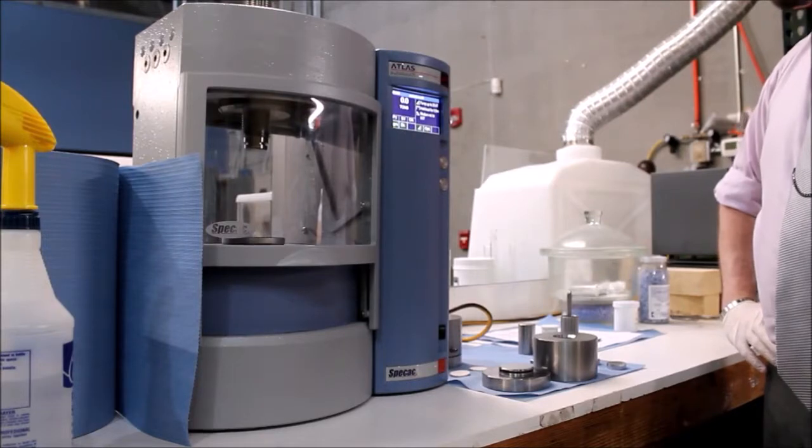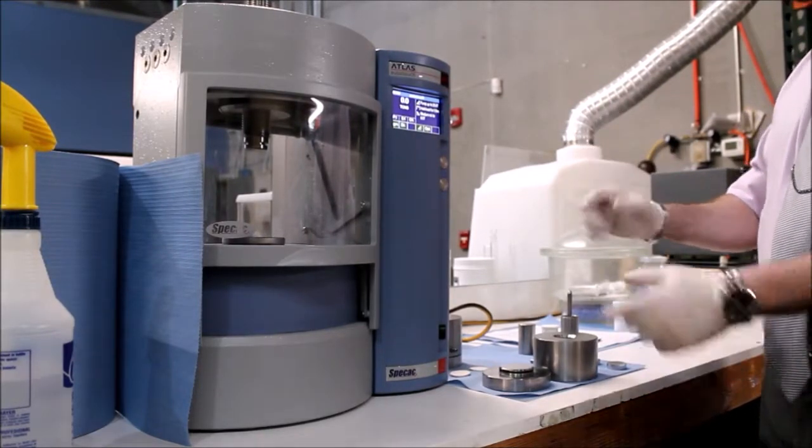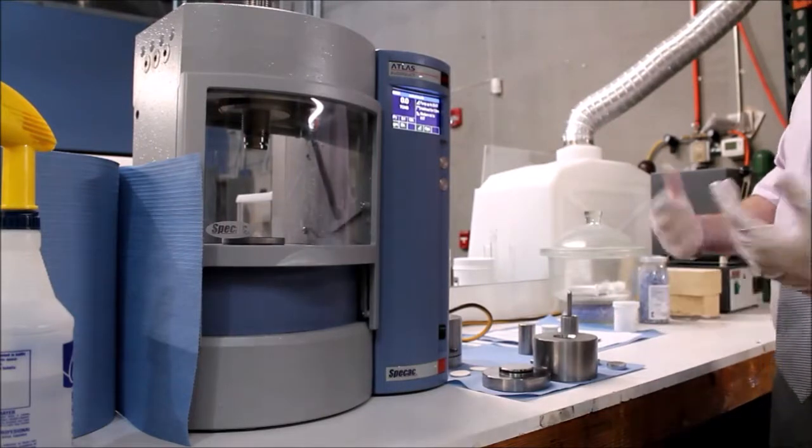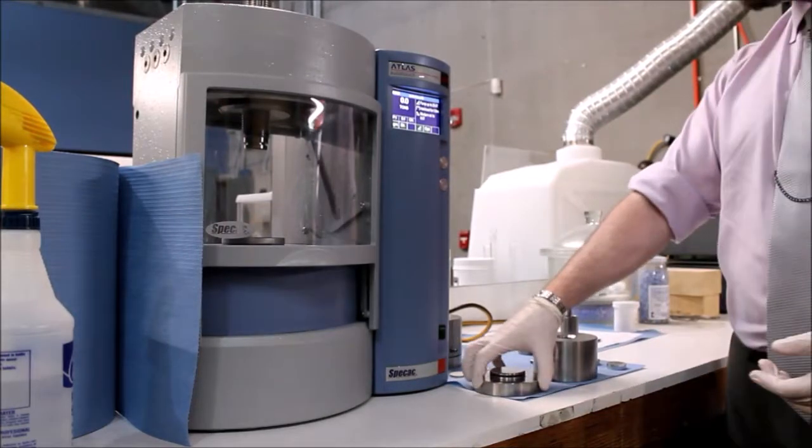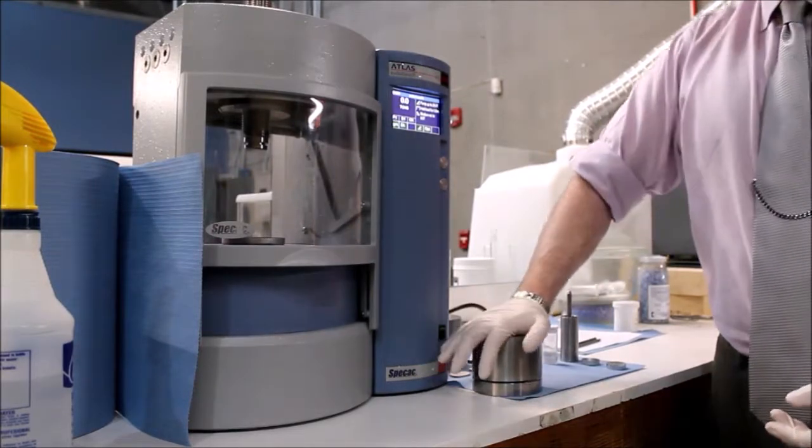Today we will be learning how to make a pellet using a 25-ton autopress and a stainless steel die set. To begin, we place the base onto the bench top and assemble the cylinder body onto the base.